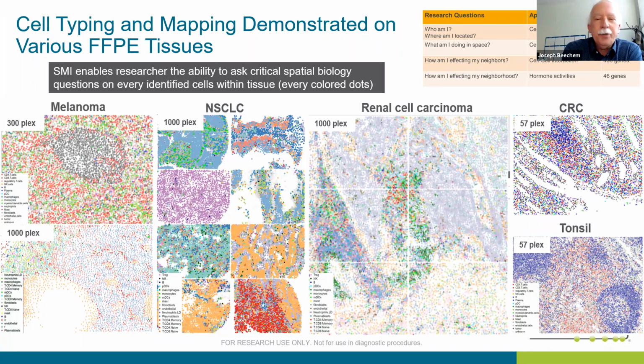I think, if you're a single cell person, one of the key things is that there's really no dropouts. When you're doing this kind of work in a spatially resolved manner, it's not like single cells where you get snippets of high expressing genes, and then you pile 10,000 cells together and get a histogram. You are deep in every cell. There basically aren't any dark cells here. You're going deep in the gene content of every single cell, with no dropouts.